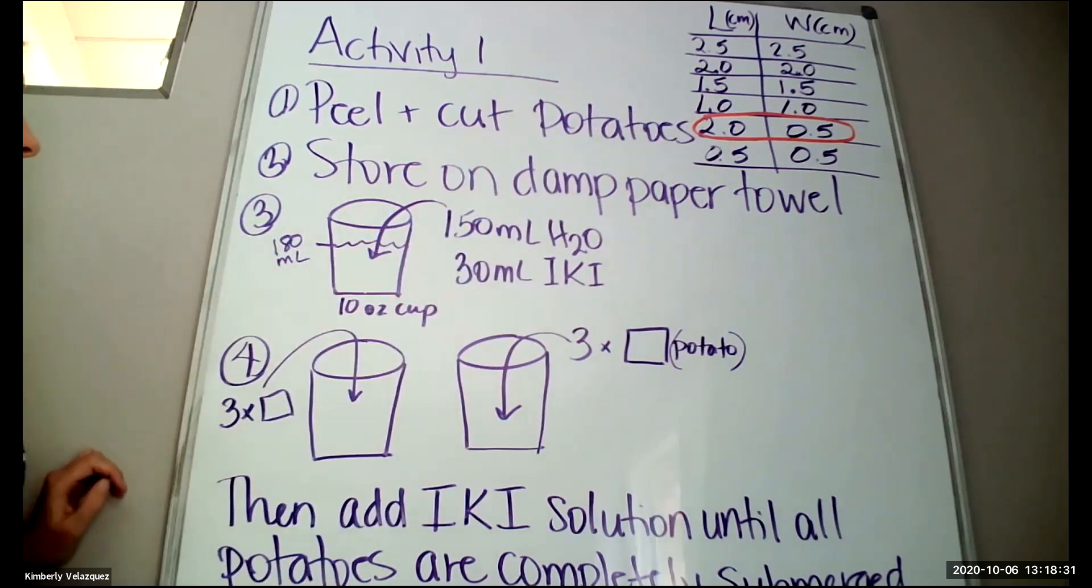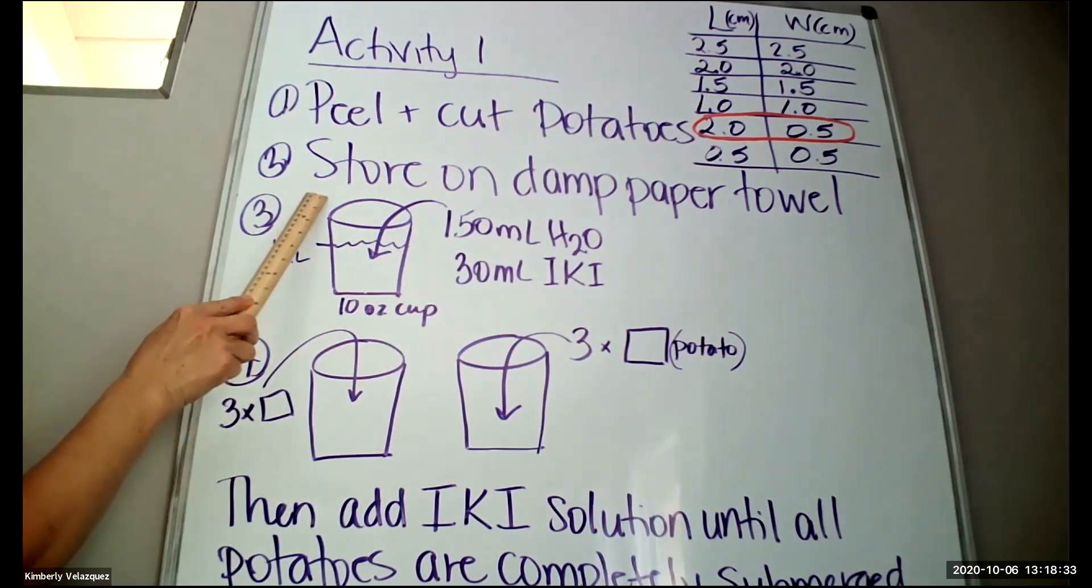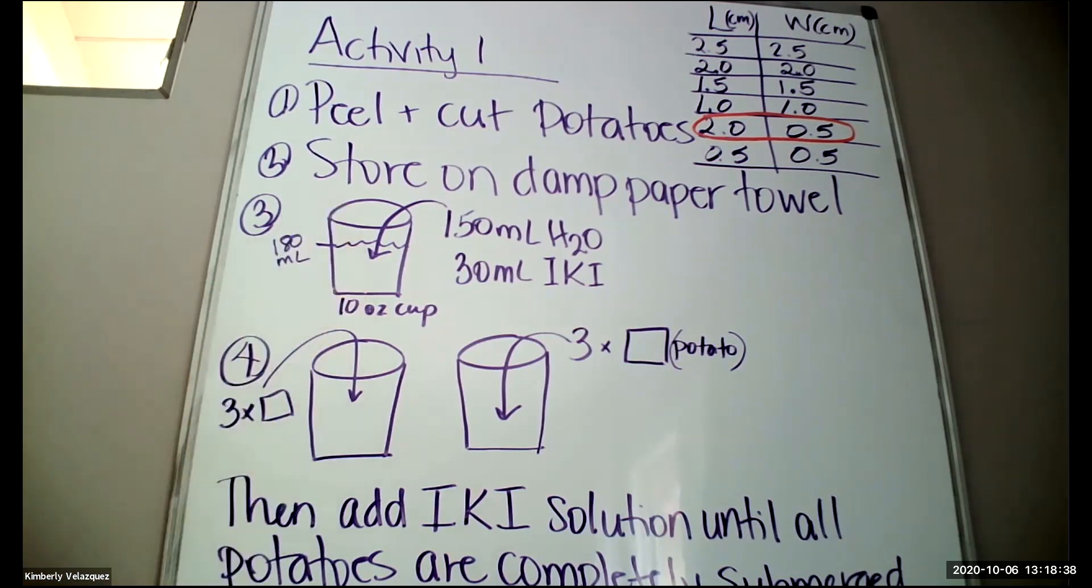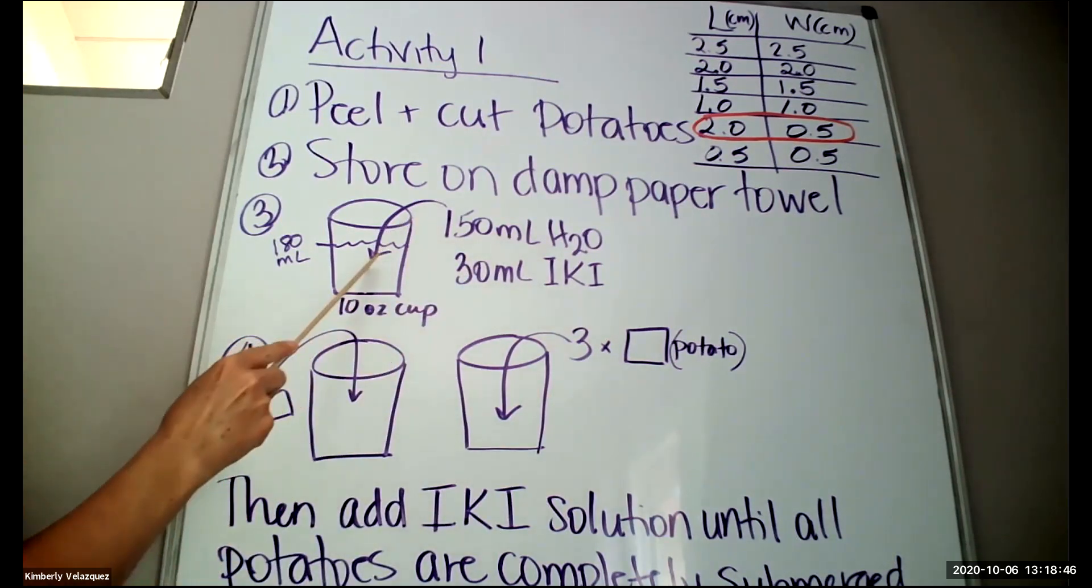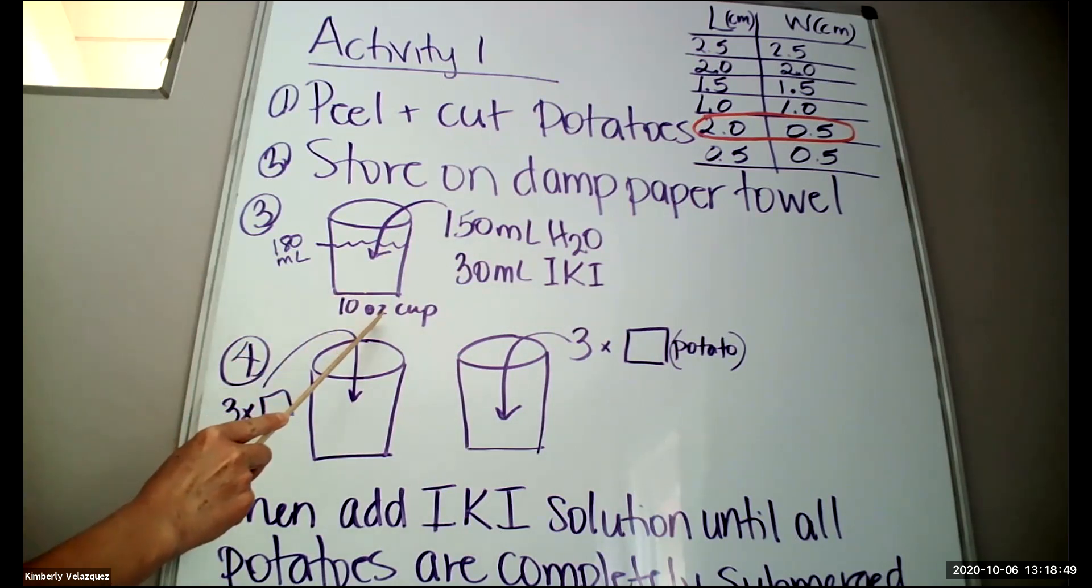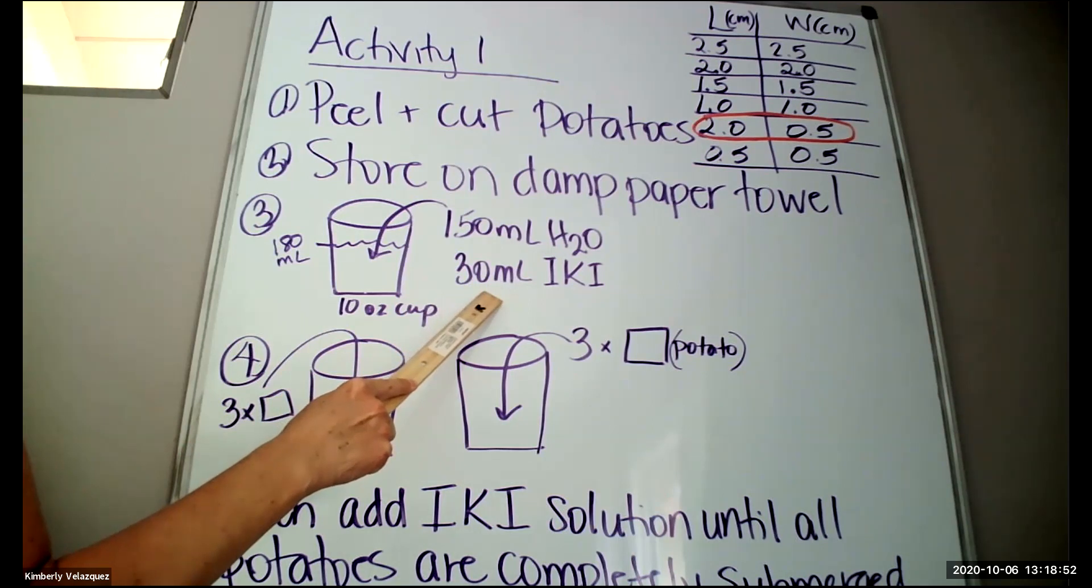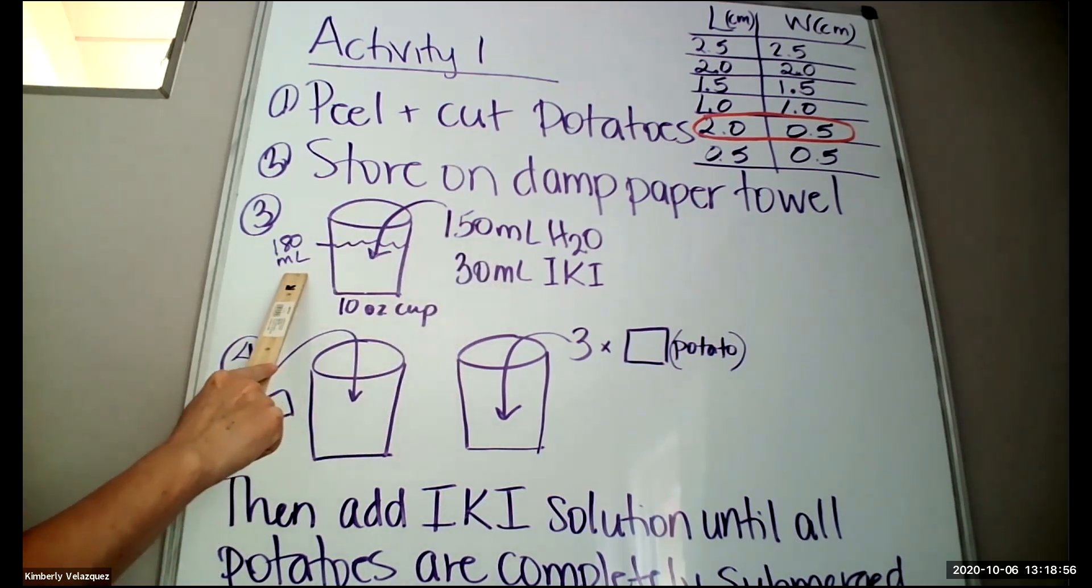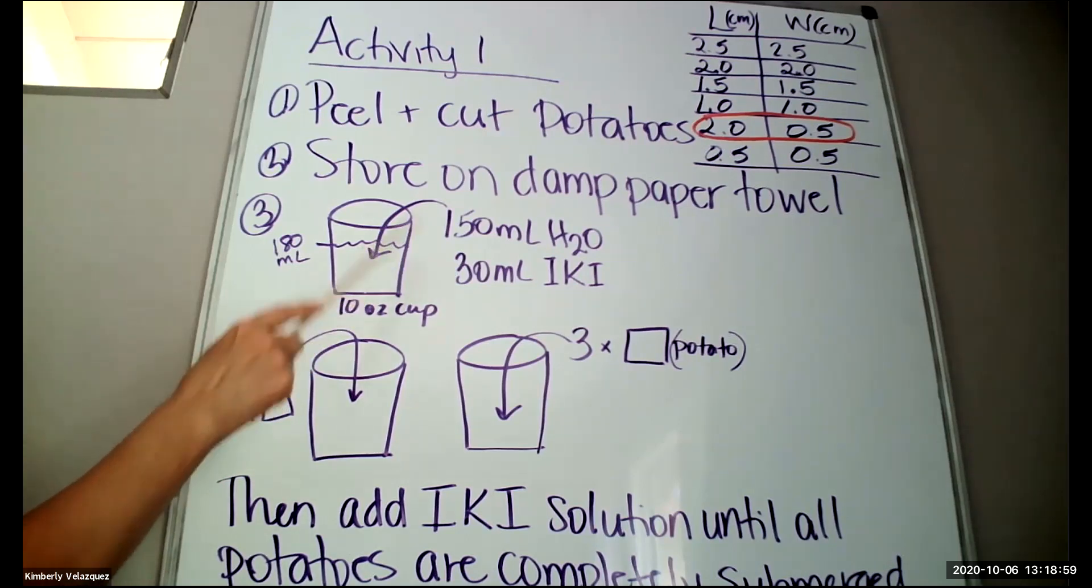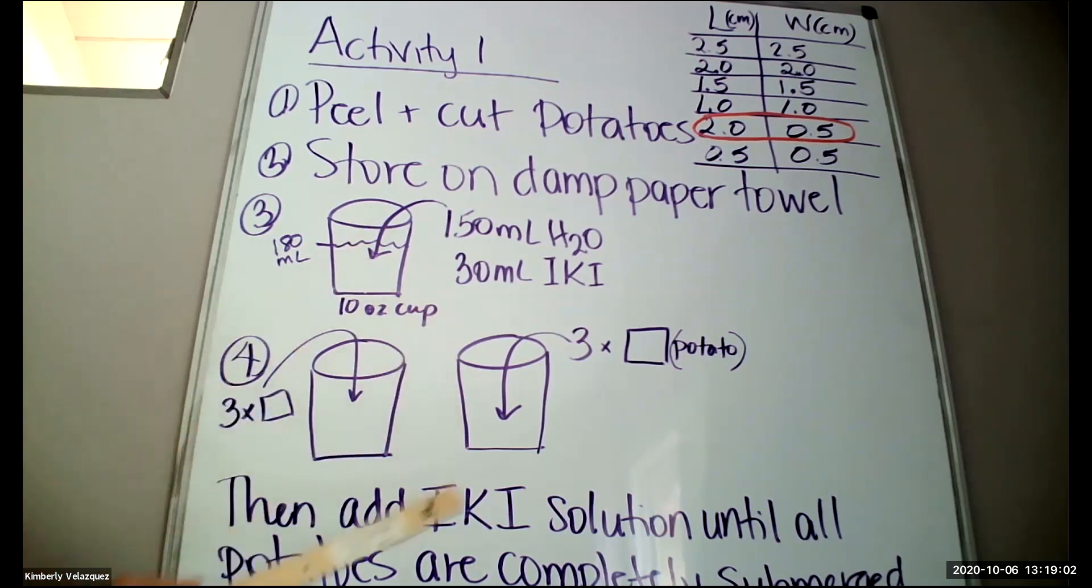Once all six of these are cut, then you're going to store them on a damp paper towel and now you're going to make your iodine solution. You're going to get two graduated cylinders, the large one and the smaller one, and you're going to measure 150 milliliters of water into one of the plastic cups that was included in your lab kit and also 30 milliliters of the iodine. So you'll have 180 milliliters total of solution in this cup. You'll mix that together and just keep this off to the side.